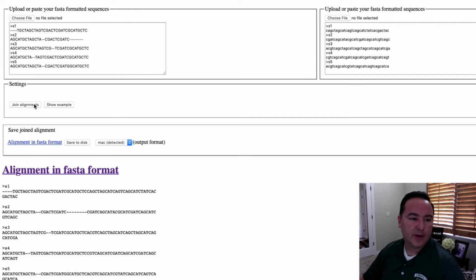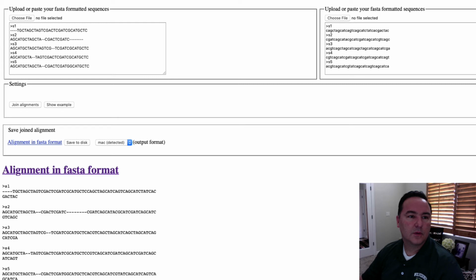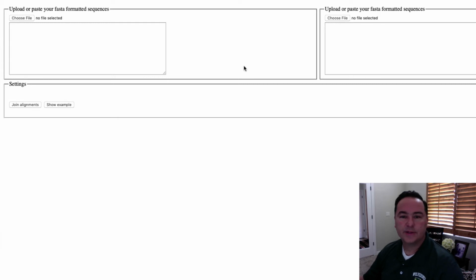Because I tried doing it with, let me get back to the main page. Hold on, back here. Okay, so here's the blank page.